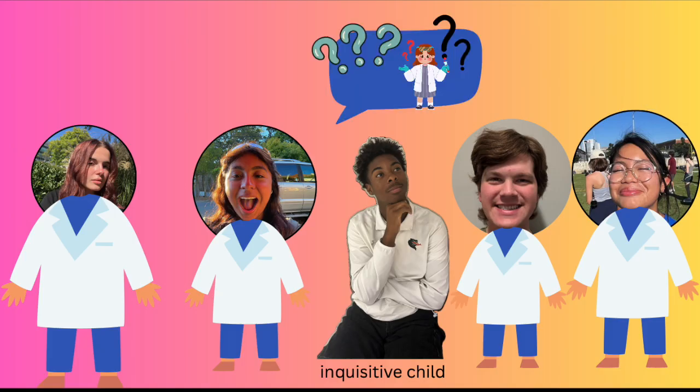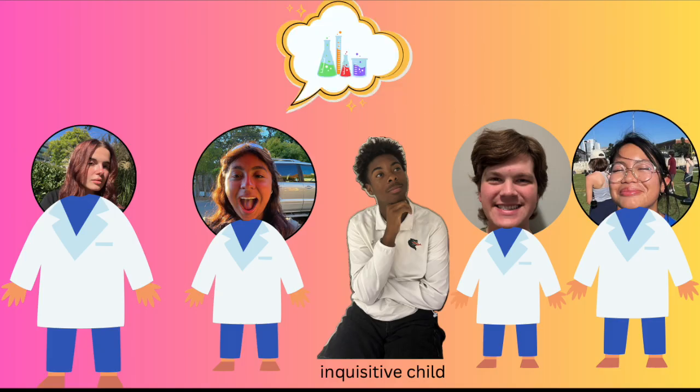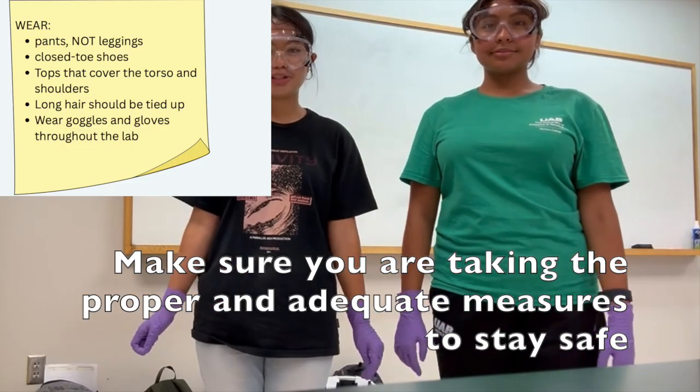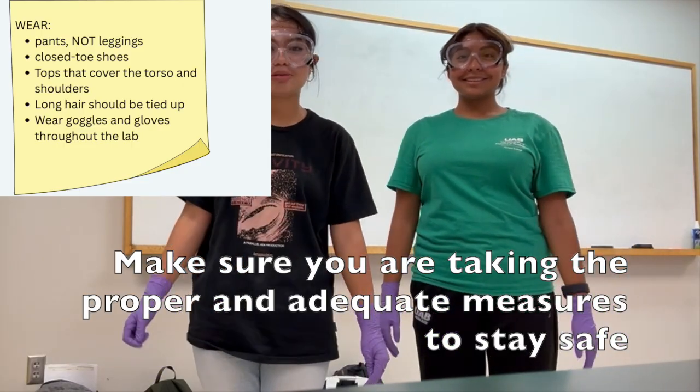the known solution. How do we read volume? Read from the bottom of the meniscus at eye level and report to 2 decimal places for accuracy. Before you start your lab, make sure that you're taking all the proper and adequate measures to protect yourself and be safe. We can get started with the lab.